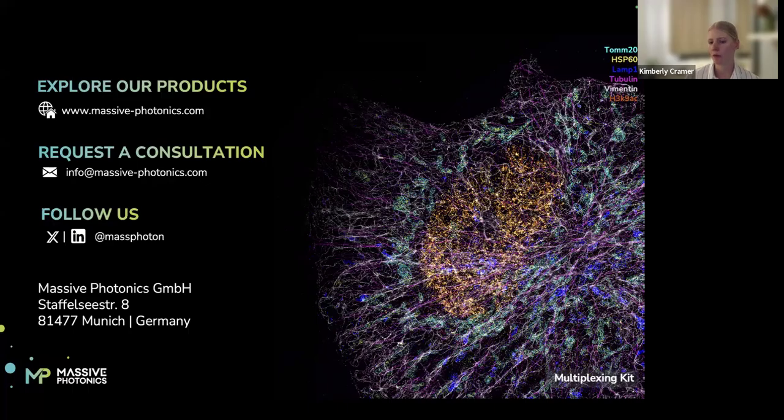When you merge all of these rounds from the same target into one image, you get this sub-nanometer scale localization precision. The RESI paper is a good resource if you're interested in learning more.